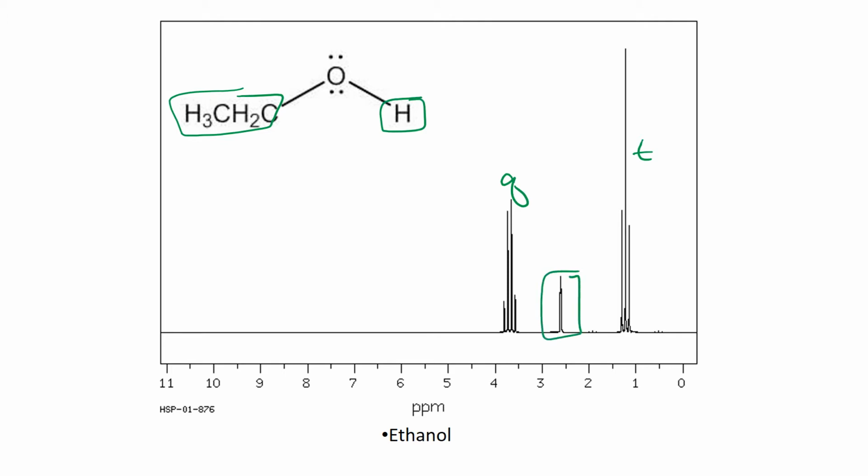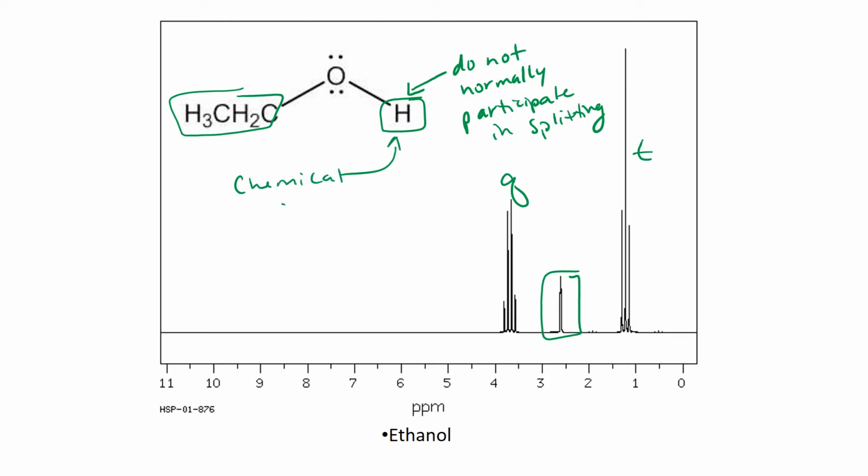Now, hydroxyls, OHs, do not normally participate in splitting. And the other thing about them is that the chemical shift can vary, because it's sensitive to hydrogen bonding, to concentration, to pH. And the other thing about the OH is that oftentimes the signal is broadened out.